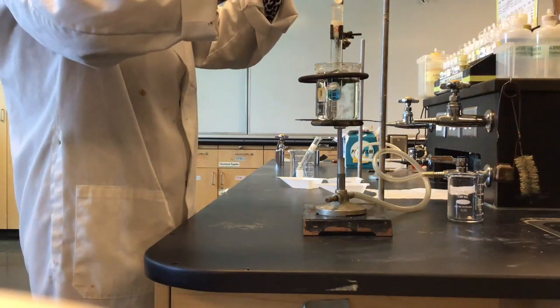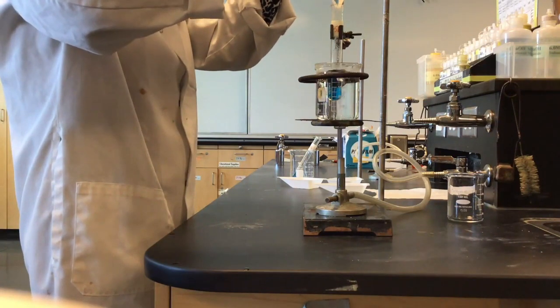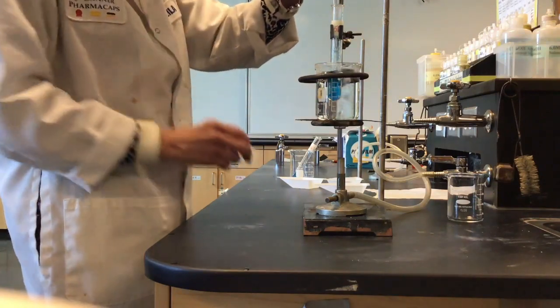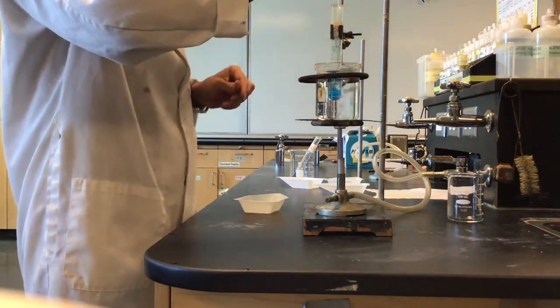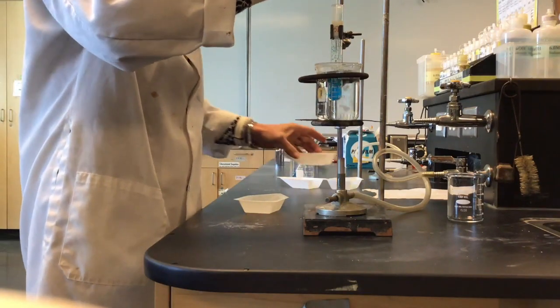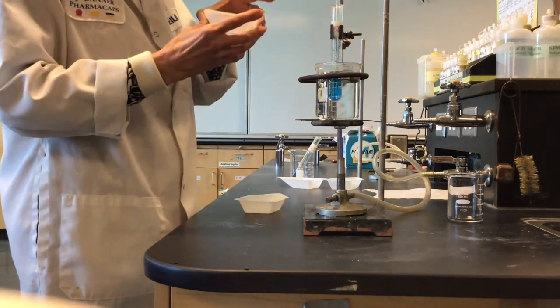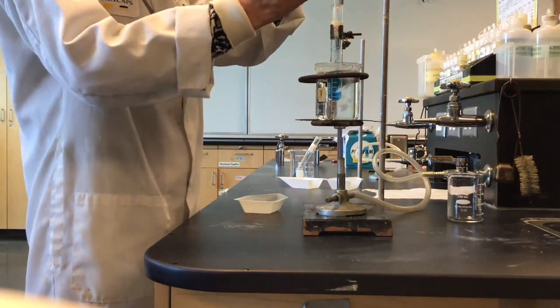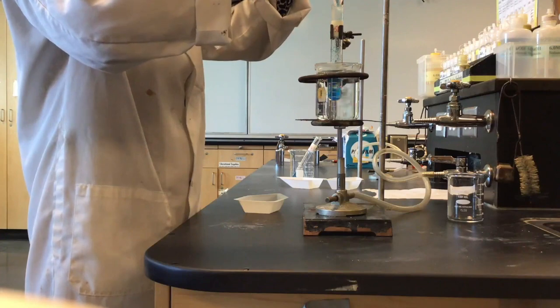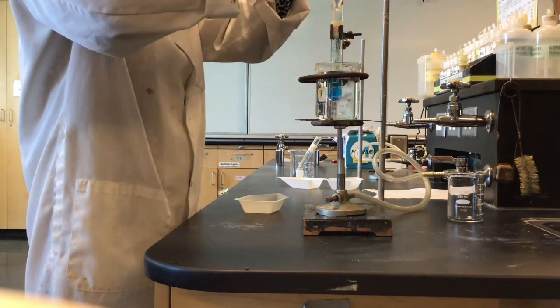So we're going to add increment number 4 to this one. And that one dissolved fairly easily. So we're going to add another one. This would be increment number 5 of our 0.5 grams.